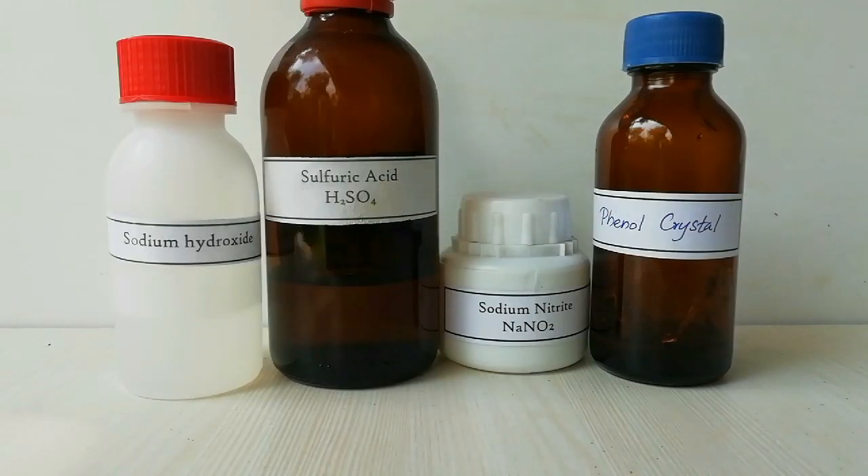This is another test to identify phenols which have para positions free. This reaction is a little bit harder than other reactions, because if you add more reactants, the experiment will not give the result you are expecting.